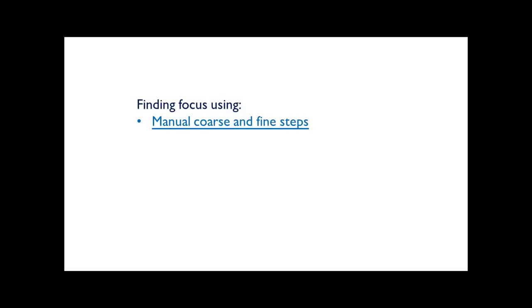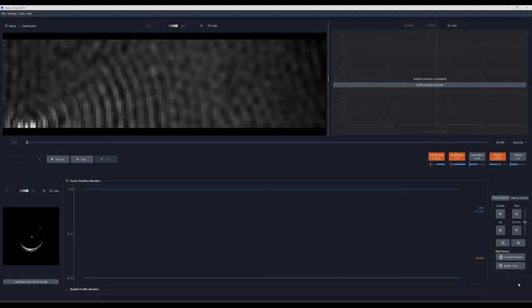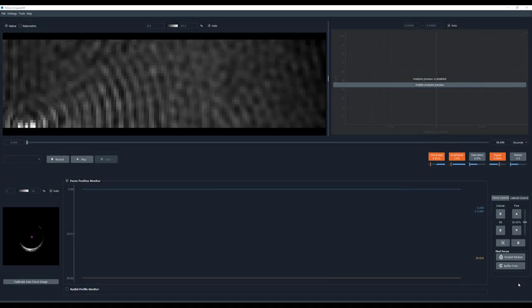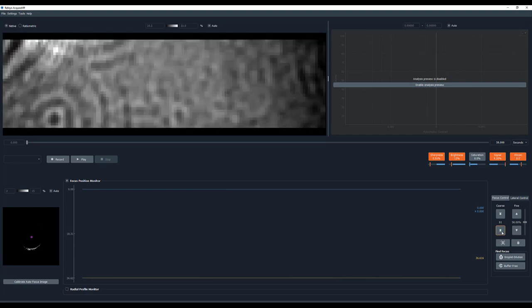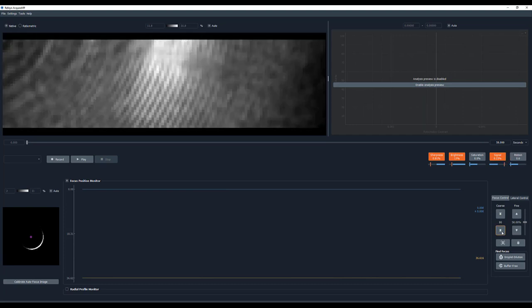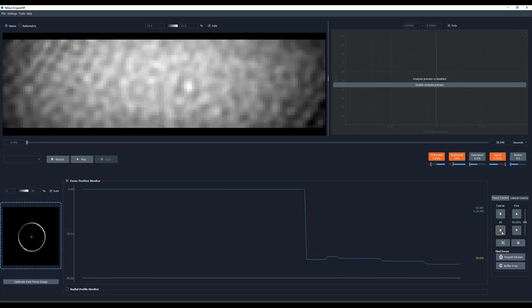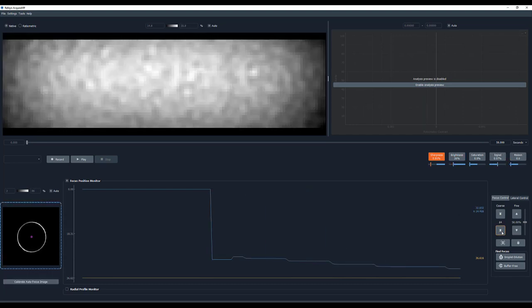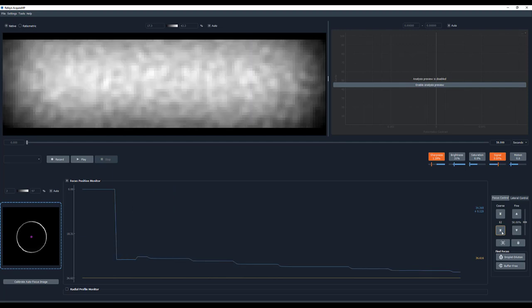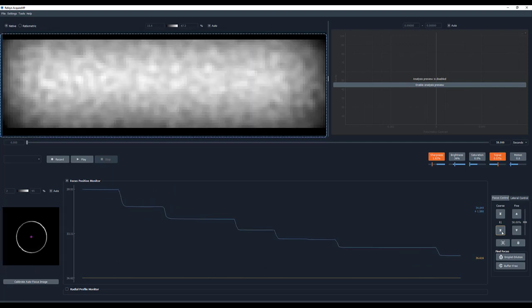To use the Manual Focus, make sure that the lid is closed and have buffer in the well. Then use the Course buttons to get you close to the focus. You will be near focus when you have a complete and well-illuminated ring and you can see the glass roughness.